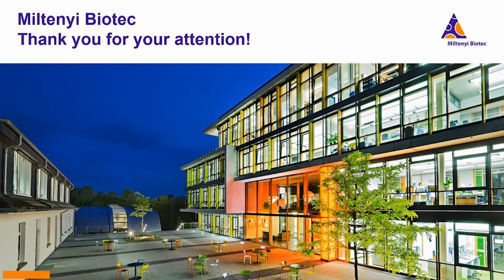Can I also isolate nuclei from plants? Oh yeah, that's basically the same kind of question. So we have already heard from other customers who are working with nuclei from plants, and actually the anti-nucleus microbeads seem to work. They have also shared some documents with us, some data that I can also share if I have the email address, that shows that anti-nucleus microbeads work per se with plant nuclei.